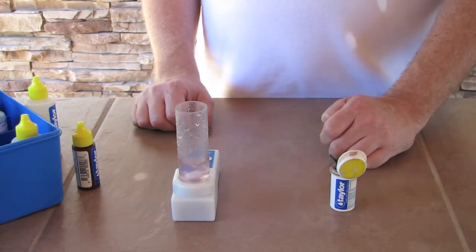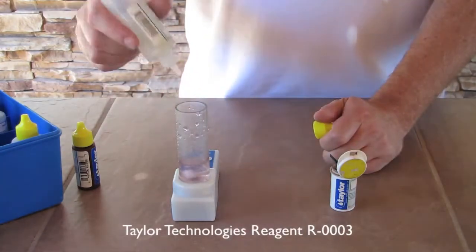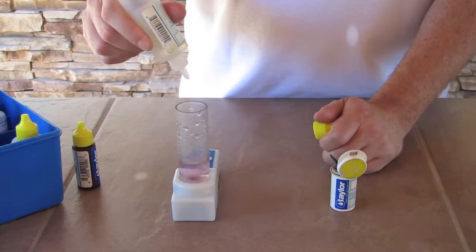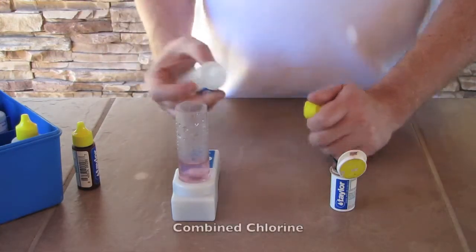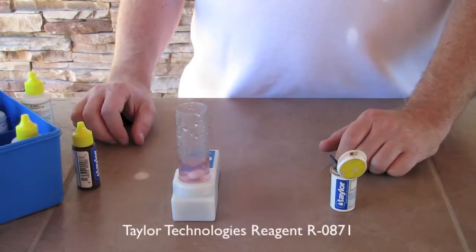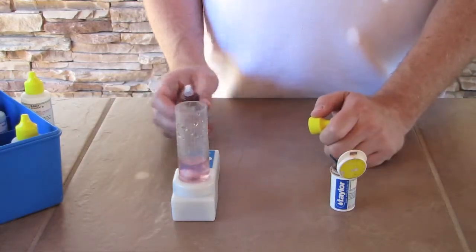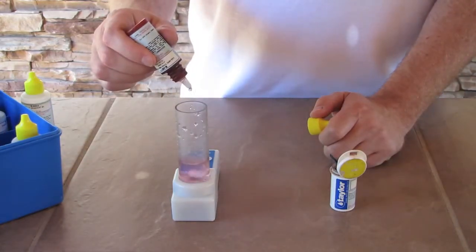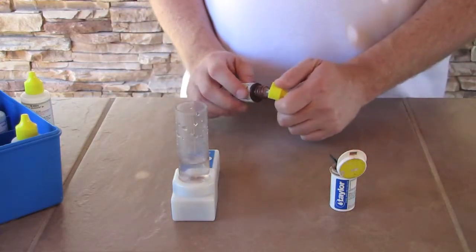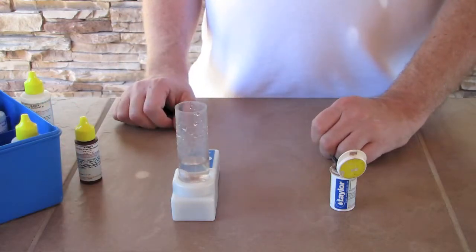Now we'll check for combined chlorines, and he will grab the R0003 and put in five drops. If the color turns pink or slightly pink, which it appears to, it indicates we have some combined chlorines. Those are your bad chlorine, and so now he'll go back to the R0871 and add the drops necessary to come back to clear — about one. So there's one drop, and we're clear. So we have a half part per million combined chlorines. We never want to be over one part per million combined, and that's your simple free chlorine and combined chlorine test.